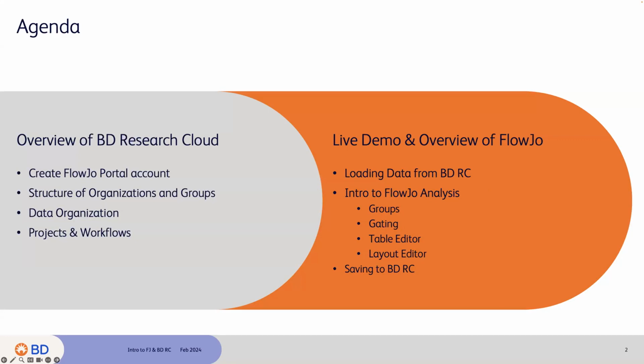So the agenda for today is we'll go through just an overview of some of the features within BD Research Cloud. We'll look at creating a BDRC or FlowJo account so you can sign in. We'll take a look at the structures of the organizations and groups within BDRC. We'll see some data organization within your org in BDRC. Then I'll focus more on projects and workflows.